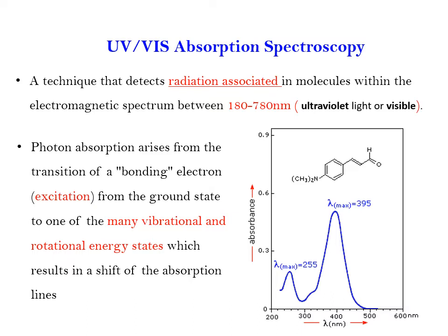The ultraviolet visible spectroscopy, or ultraviolet visible spectrophotometry, refers to the absorption spectroscopy or reflectance spectroscopy in the part of the ultraviolet light and the full adjacent visible spectral regions. This means it uses light in the visible and adjacent ranges. All lights that are absorbed or emitted in the visible spectrum or in the ultraviolet region can be considered under ultraviolet visible spectrum absorption spectroscopy.